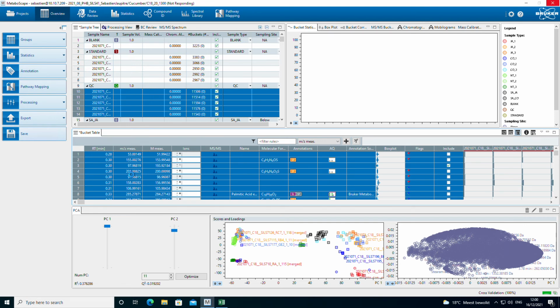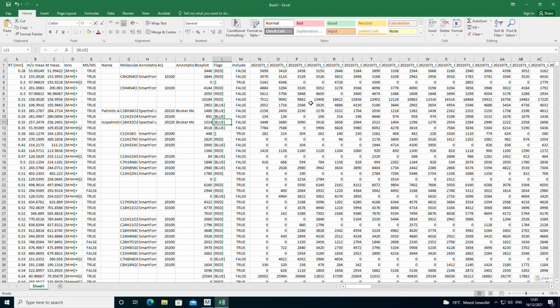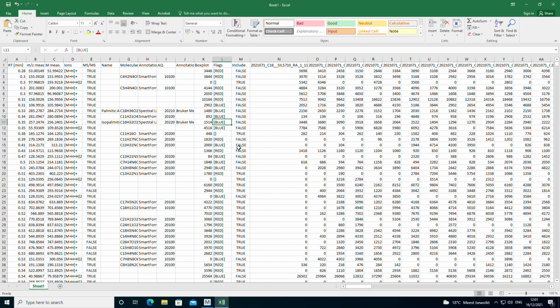It is still copying. There are 14,000 features, so it's quite a large table in the end. Yeah, seems copied. And here you have your table. Next is going to be the table transformation and making it tidy for further analysis. So here you are.